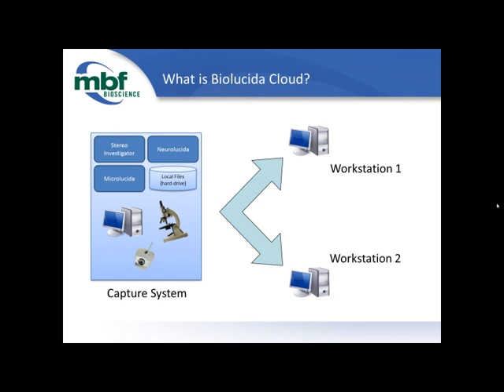Yeah, and I think it would be tedious also, but it's not even just about storing large image files and moving those around. Even small files can be tedious to manage. Let's say instead of doing virtual tissue captures, you were performing an SRS image stack acquire, and you had maybe 40 or 50 stacks for each tissue specimen that you had. How quickly do you think you could find something you had captured 2 weeks ago? It depends on how organized my lab notebook is, I guess. Yeah, that's a good point.